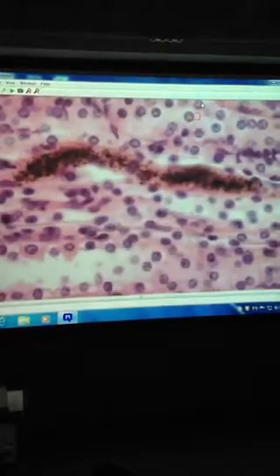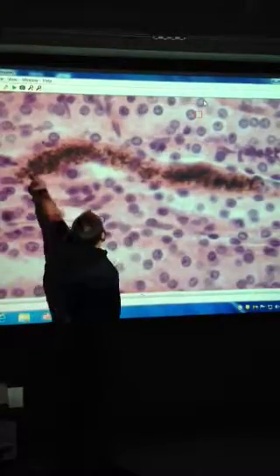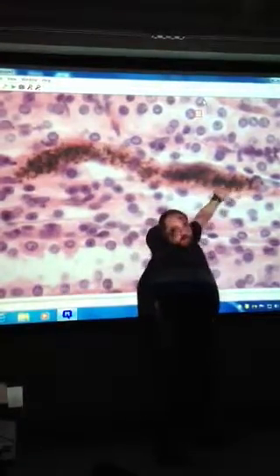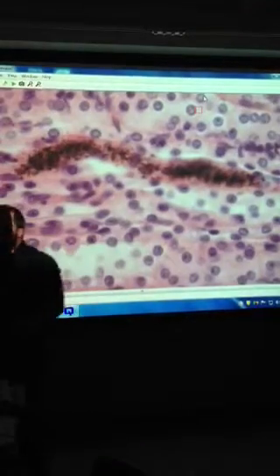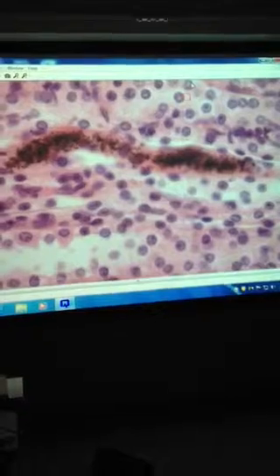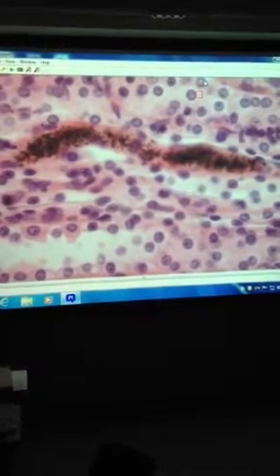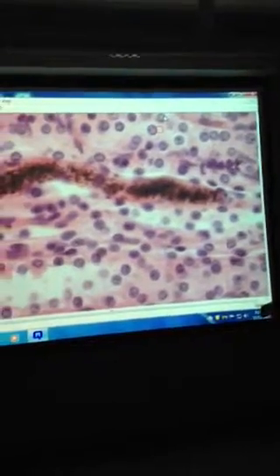Okay, if we have a blood vessel here, and these are all those collecting, see how linear everything is? So this is all still collecting tubules, and we have a blood vessel here, a capillary. So what is that capillary part of? This is down in the collecting tubules, and it's down among the. Oh, the vasa recta? Vasa recta. Yes. Very good. So that's part of the vasa recta.